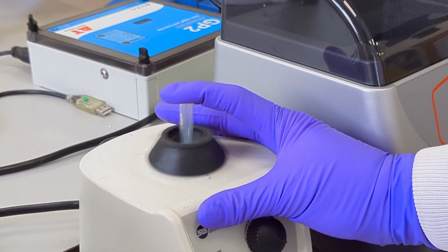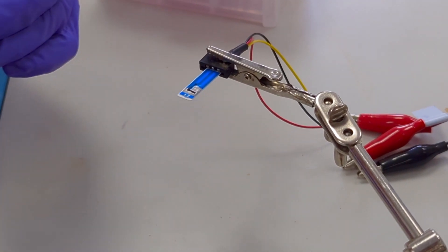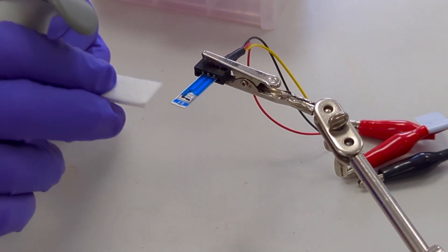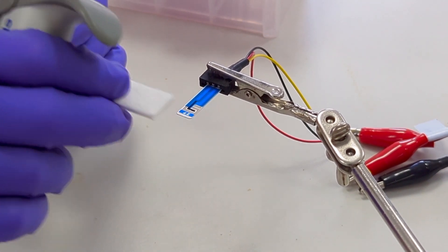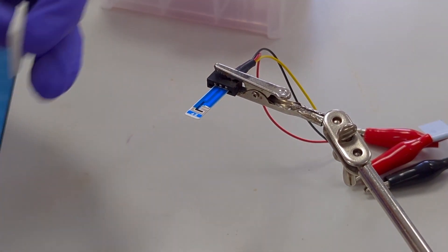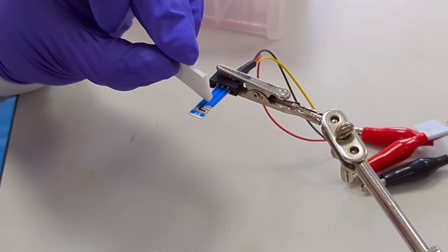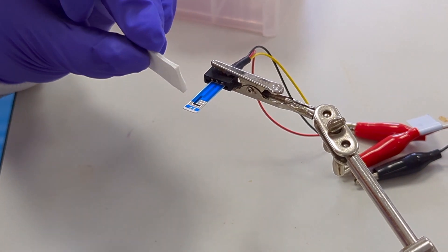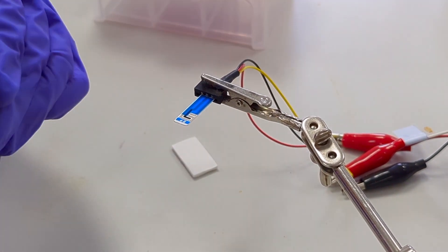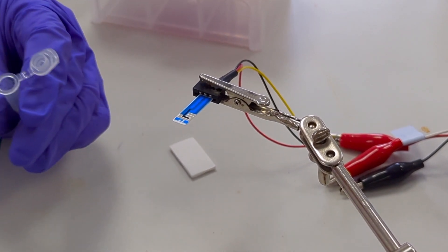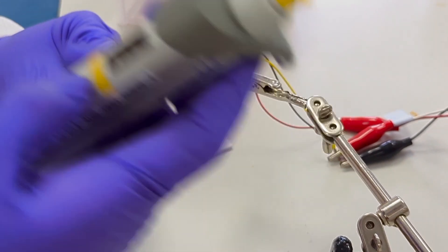Now, in order to homogenize the solution, I vortex it. Using a piece of blotting paper, I carefully wick off the buffer solution, making sure not to touch any of the electrodes. Once that's done, we can pipette 40 microliters of our prepared sample onto the sensor surface.